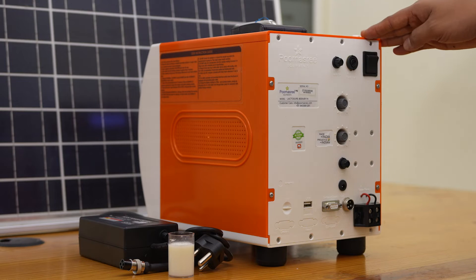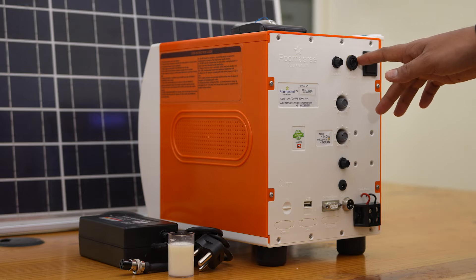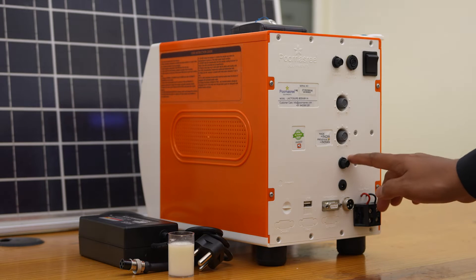The back panel section of Lactosure Eco SV contains the power switch, analyzer fuse, charger fuse, frequency adjuster of the stirrer, timer adjuster of the stirrer, and DC fuse.